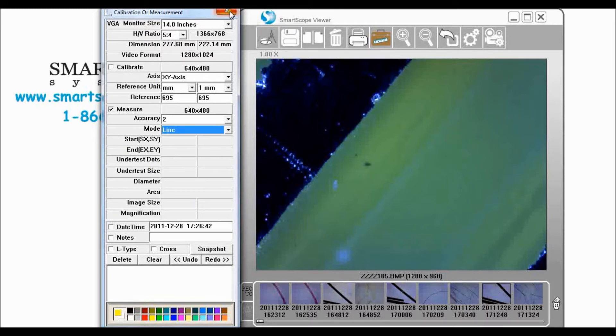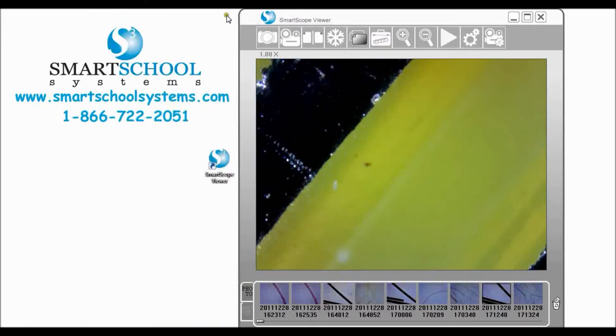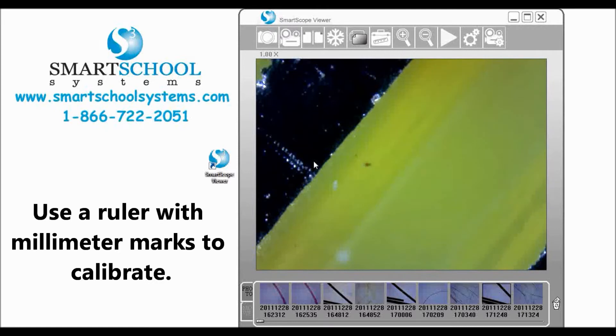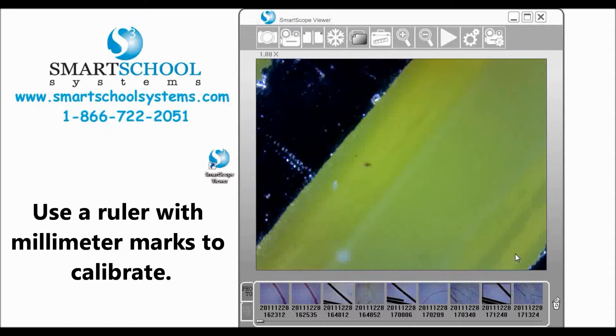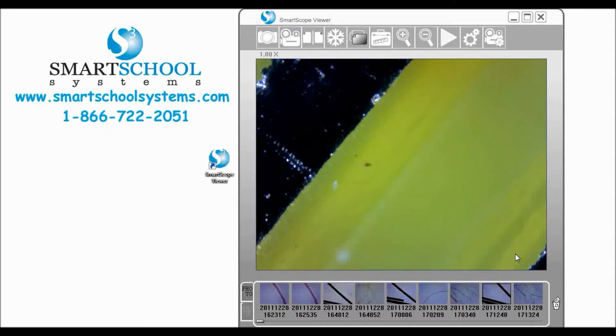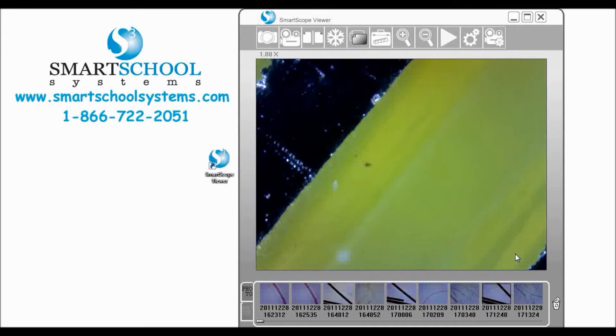So let's go ahead and come out of that for the moment. What you need to do first is we need to calibrate our SmartScope for measurement and the way that you do that is you get a ruler and you line up the millimeter marks on your SmartScope and get that into focus.